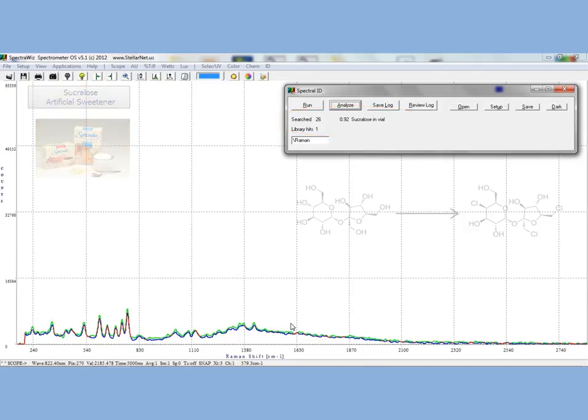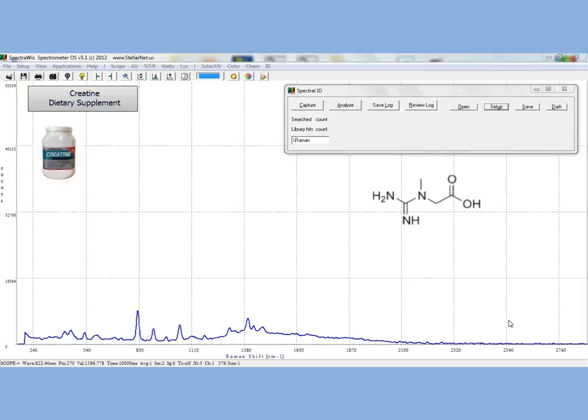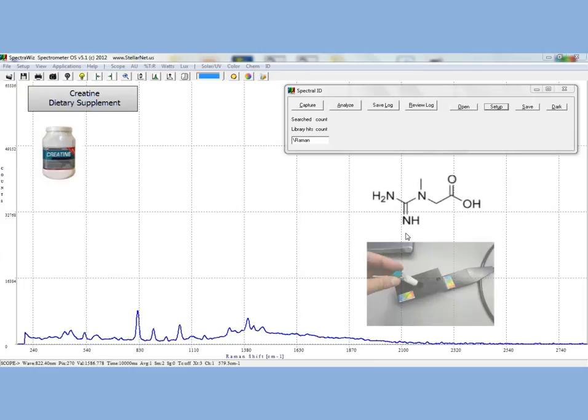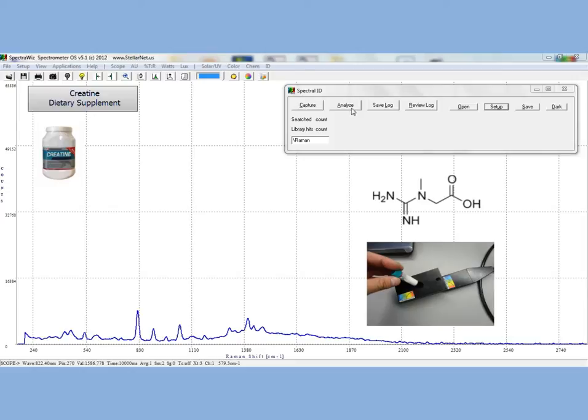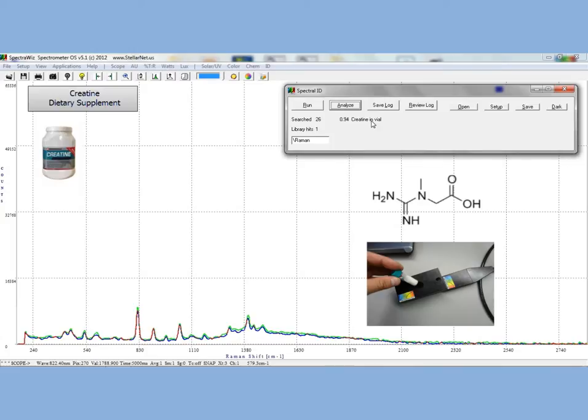For our next example, we will be measuring creatine. Creatine is a nitrogen-based organic acid that occurs naturally and helps to supply energy to the cells of the body, especially your muscles. Creatine supplements are used by athletes, bodybuilders, wrestlers, sprinters, and others who wish to gain muscle mass.